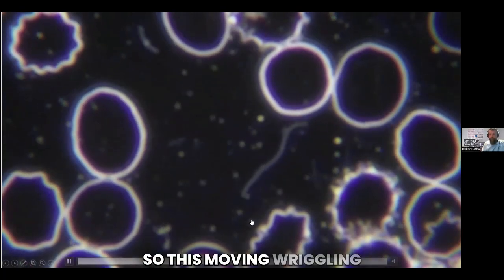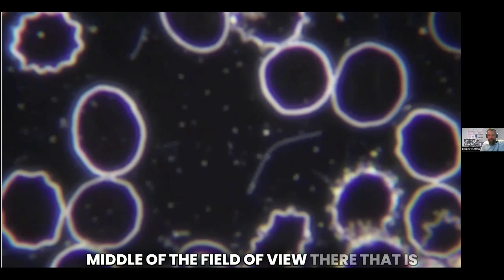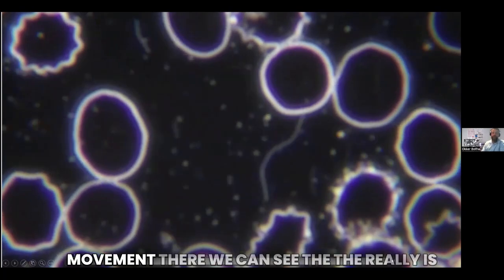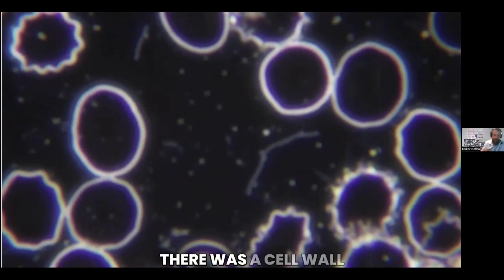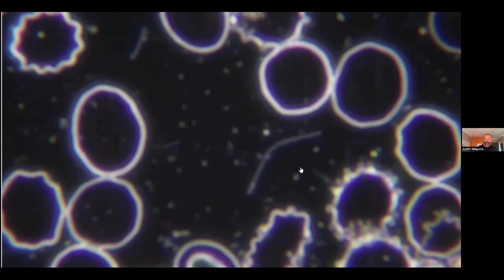So this moving, wriggling worm-like structure in the middle of the field of view there is actually a cell wall deficient bacteria, or L-form bacteria. And the movement there, we can see it really is flexible, and that's obviously not something that's possible if there was a cell wall. Wow, that's fascinating. Wow, very cool.